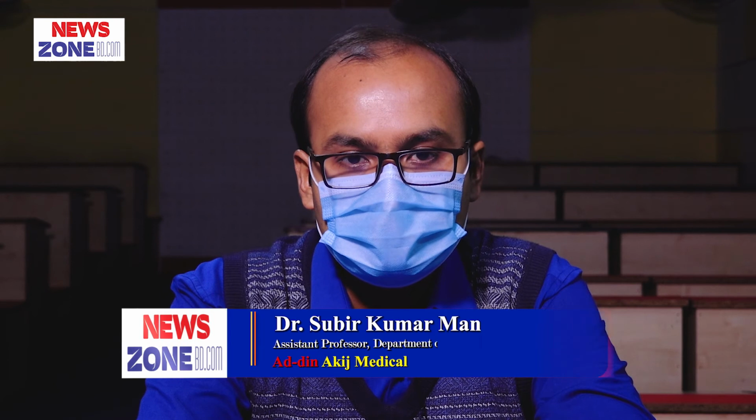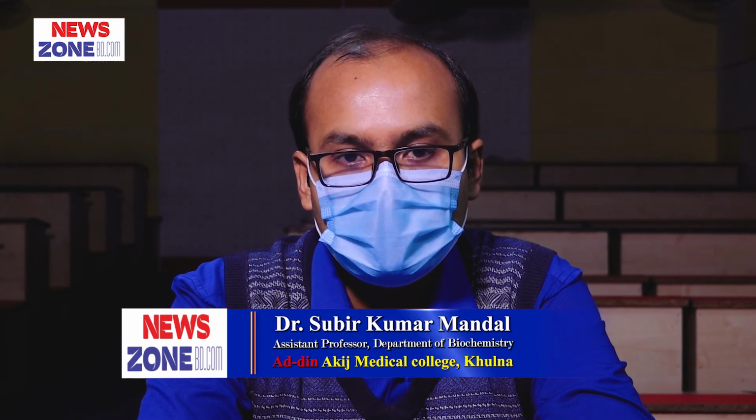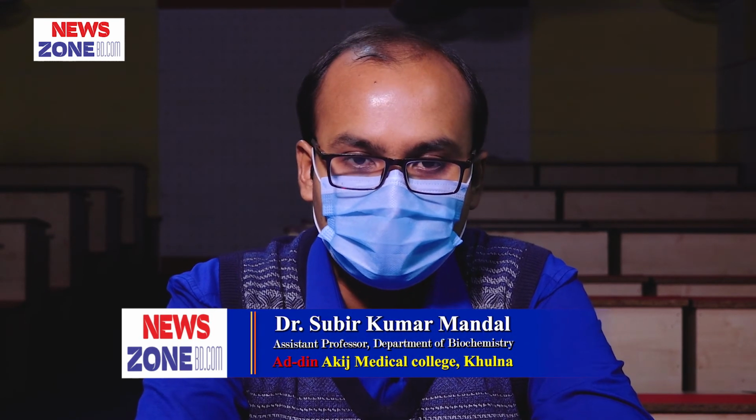Now, what are the first aid techniques during any hazardous environment? First, all laboratory workers should undergo simple first aid training. For all chemical splashes, wash with plenty of water for 10 minutes. Control bleeding with direct pressure if there is any physical injury, avoiding any foreign body. Report all accidents to your supervisor or departmental safety officer.